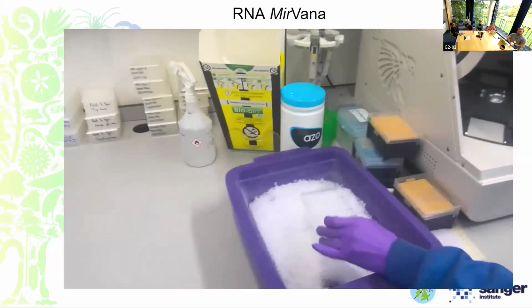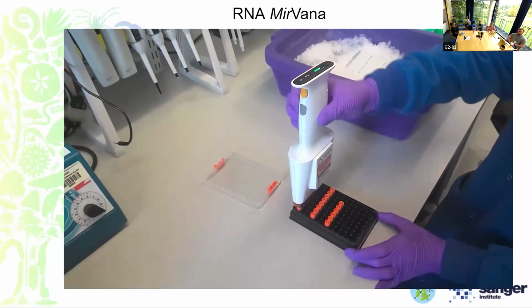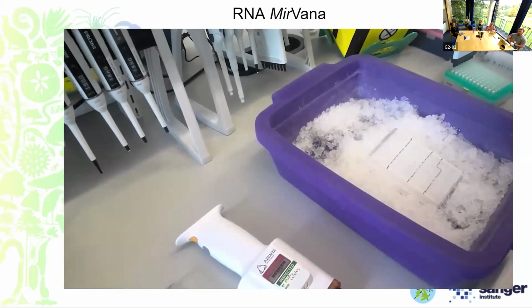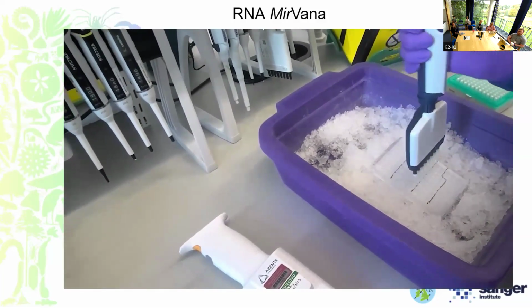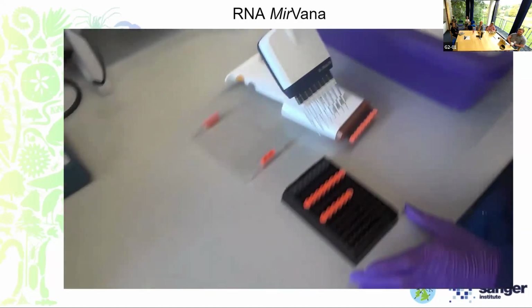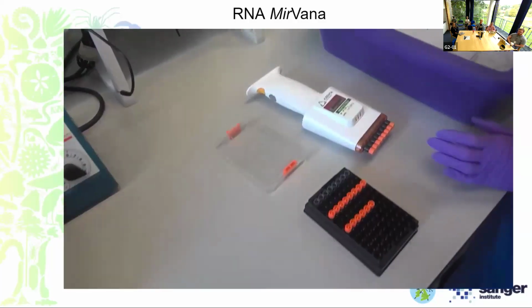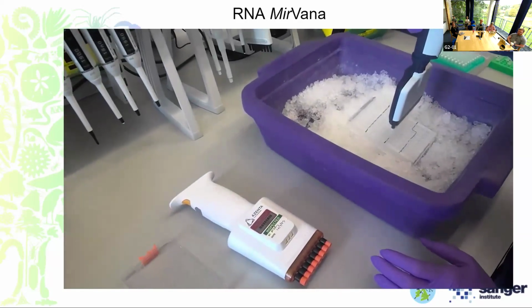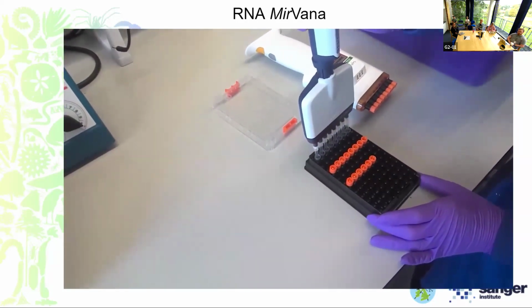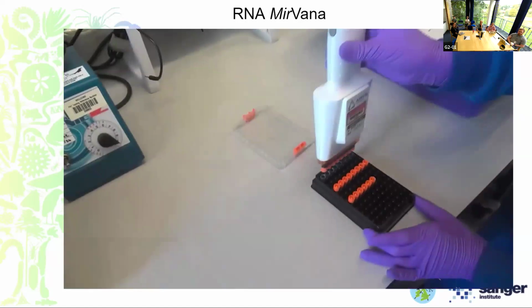And then once it's finished, you will have a plate with hopefully all your RNA in the elution plate. So we'll pop that on ice, and then we'll transfer the eluates to FluidXs, just so then it's easier for storage and also knowing which sample is which. So we just transfer those to the FluidX tubes, and once they've been transferred, we tend to do some QC. So we'll do Qubit and NanoDrop for our RNA. And then depending on the QC, our RNA will hopefully be submitted for RNA-seq, where we send 100 to 200 nanograms to be sequenced.